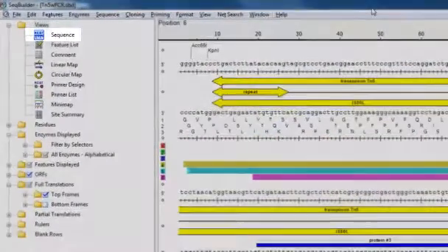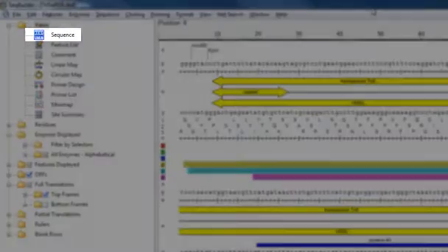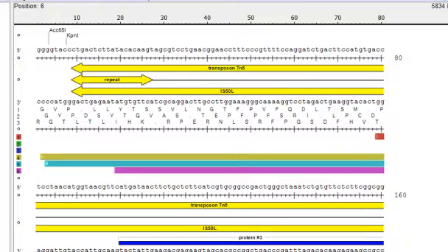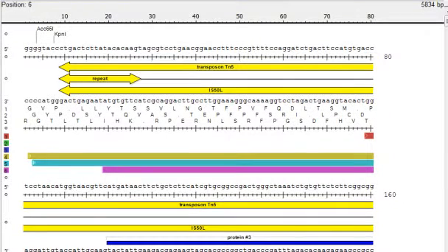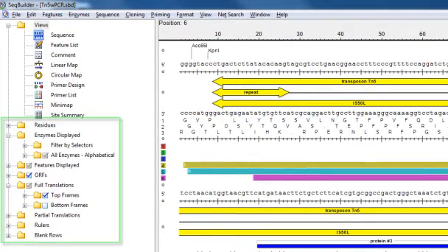The Sequence View displays your nucleotide or protein sequence at the residue level. And in addition to the actual sequence, you can display features, ORFs, restriction enzymes, and translations. And all of those items are controlled by the selections you make here in the curtain.